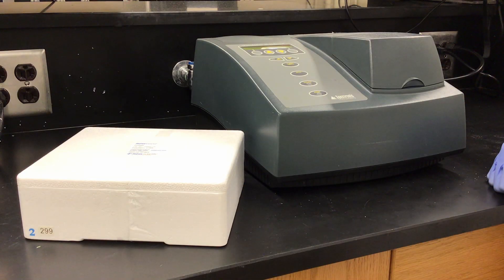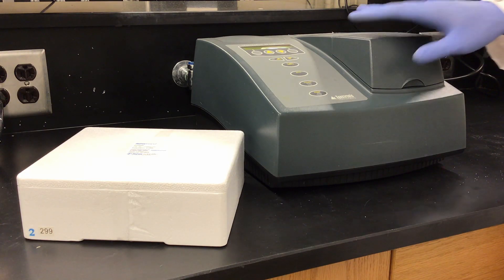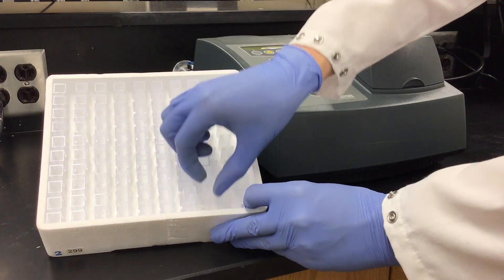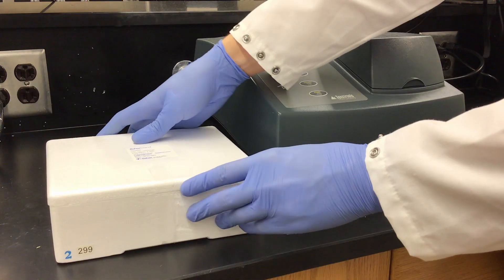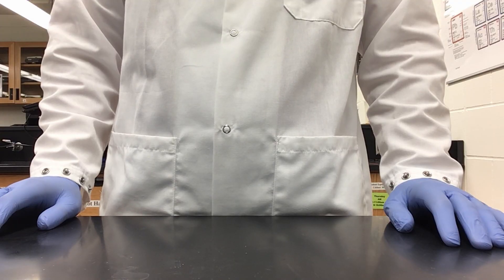Now we are doing part 4 of reversible and irreversible reactions. In this part, you will be taking your solutions of cobalt and using the Spectronic 20 to measure absorbance. Instructions on how to use the Spectronic 20 are posted on Canvas. We will need to have our solutions made in a cuvette, and next I will show you how to prepare all of your solutions.